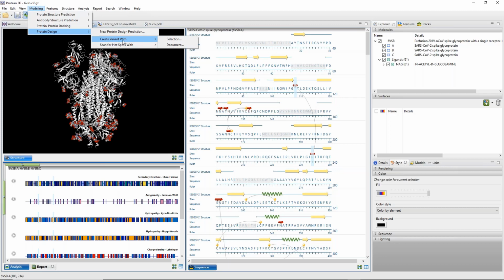So that's one way we want to remind everybody of the interconnectedness of our molecular biology experiments and also the protein and structural biology experiments, is that we can really help transition you to being able to view the rotamers of those non-synonymous variants that you're detecting with the SeqMan Pro or SeqMan Ultra tools, or with our SeqMan NGen product, or any other ways that you're doing your sequencing. So just bear that in mind, that we're going to look at this protein design component, and the information we will use here will be coming from your NGS data or your Sanger data that you're producing in the lab.